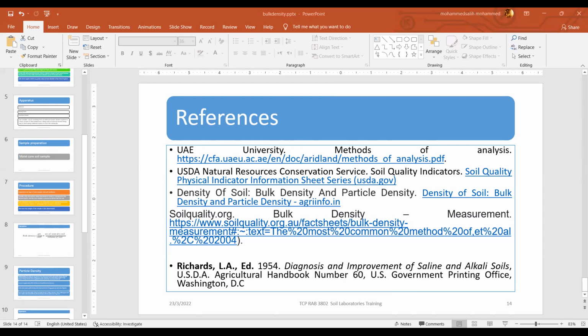There are many videos showing how the pycnometer works. I can share them with you, but firstly, if there is some intervention from your side, then we can try to see these videos. It will be helpful in the process of understanding these two methodologies.